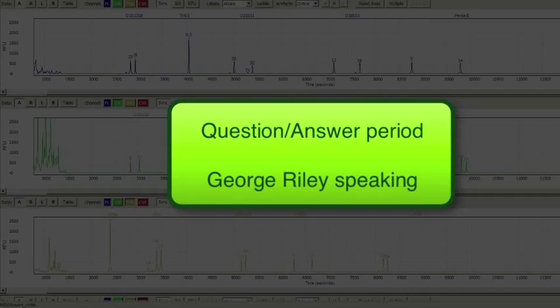Next question is, can I view the sample information, the injection time and the voltage? At this point, you can't do that in OSIRIS, but that is something that we are actually also looking at. That's been a user request for development, and that's definitely something that we have on our to-do list.